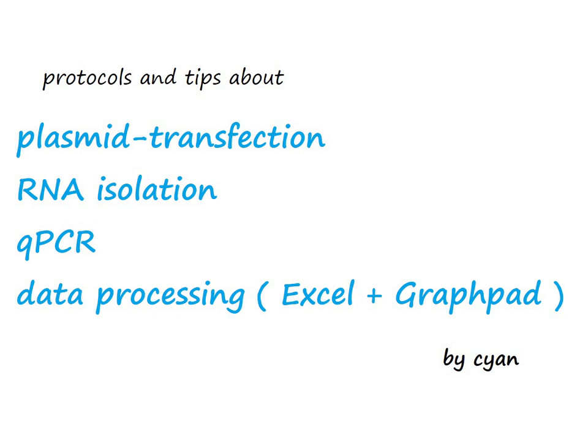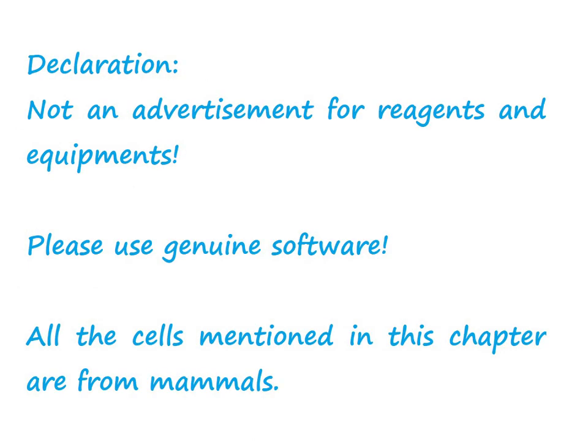Protocols and tips about plasmid transfection, RNA isolation, qPCR, and data processing by cyan. Declaration: this video is not an advertisement for reagents and equipment. Please use genuine software. All the cells mentioned in this chapter are from mammals.